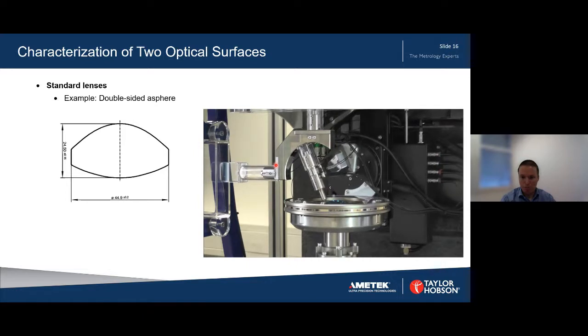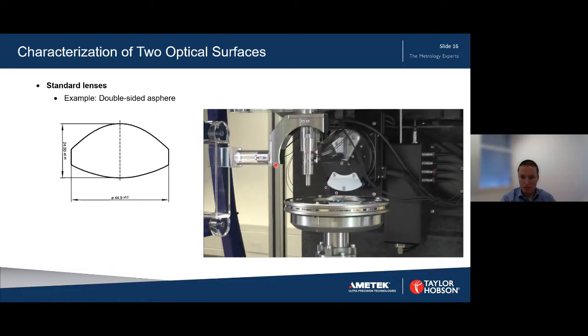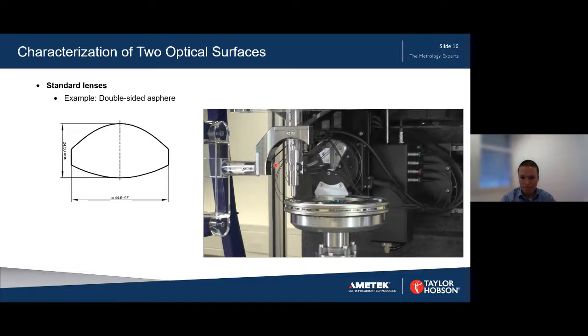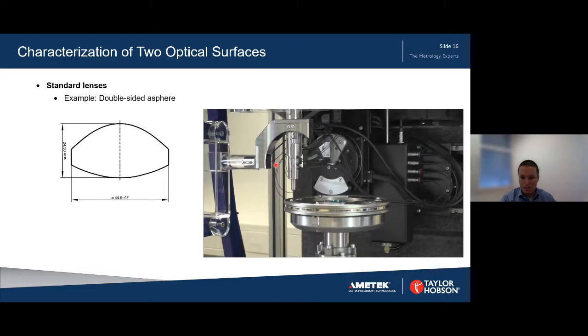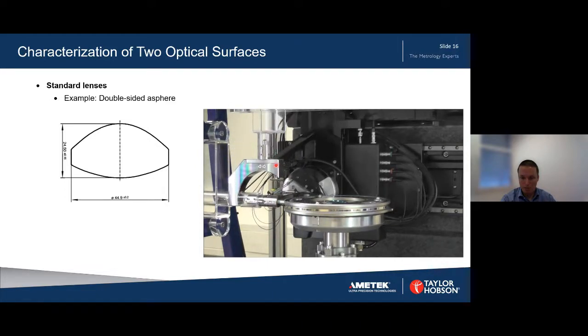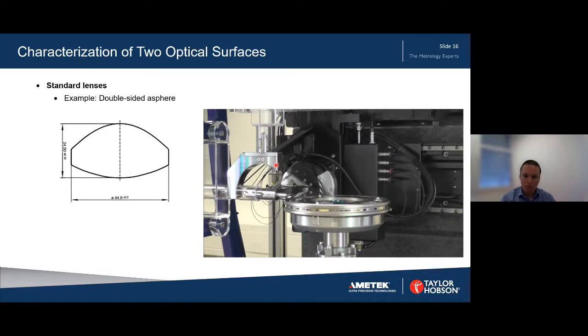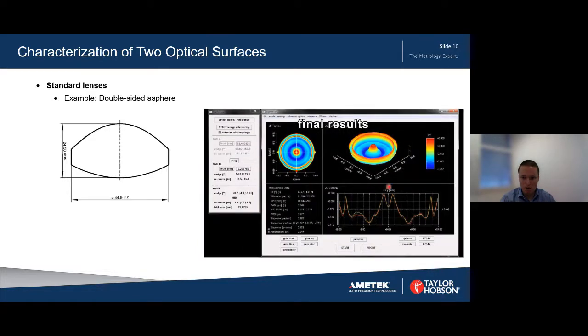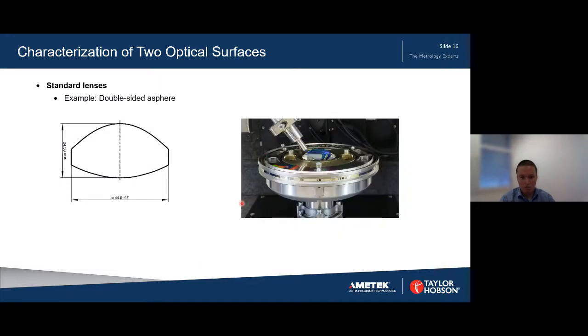And after the optical surface, again, the axial runout, and the radial runout, so we know where the reference ring is placed in the system. And then we can combine the two pieces of information of the first measurement and the second measurement, and we get the result: wedge, decentre, and thickness. And we can calculate wedge and decentre here because it's a double-sided aspheric lens.